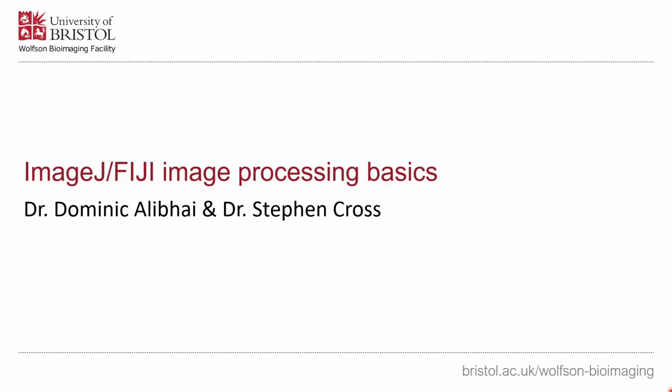We're going to do this using an example workflow. So what's going to happen is I'll talk for a few slides, going through some of the basics of ImageJ in general, the interface, and also how you load and save images and navigate around images once they're open in ImageJ. Then we're going to step by step go through core functionality within ImageJ, such as filtering and thresholding, and then see how this can be applied to this example workflow of segmenting cell nuclei and then measuring some properties and plotting that data. You'll find the worksheet and the example data at the GitHub link shown here.